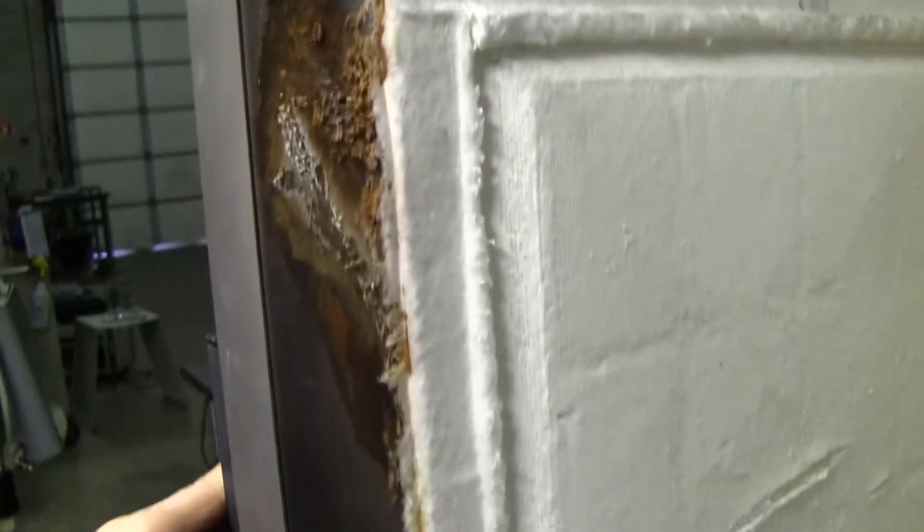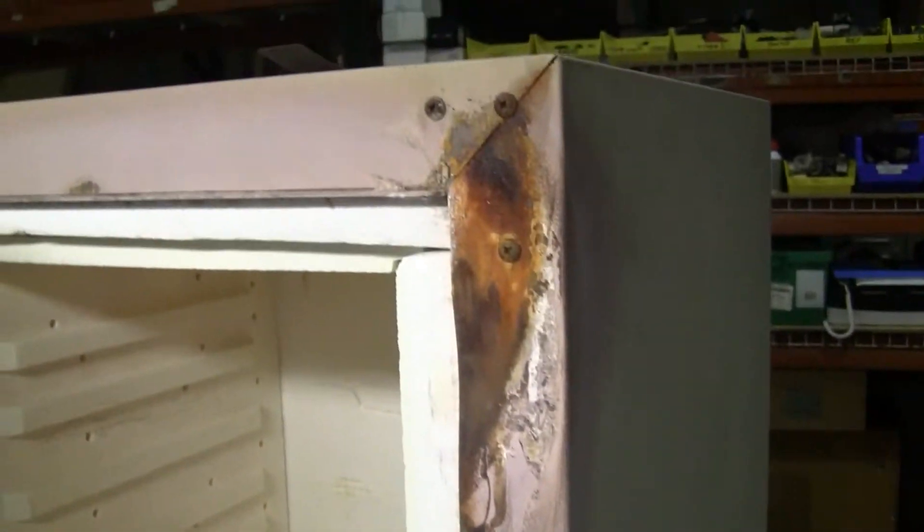Inside, please note the deterioration on the door. This would be a perfect ashing furnace.